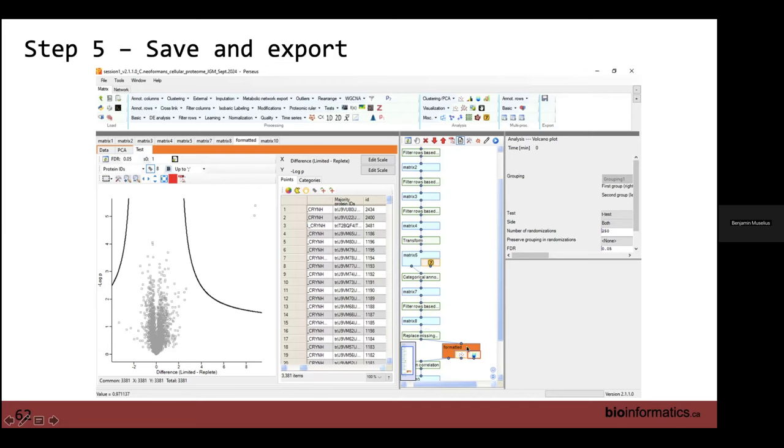We're working with data we've done everything to. This is where we're doing our volcano plots, things like that. Then one down below here, you can also see our column correlation, and this would be the matrix that had all of that information in it as well.